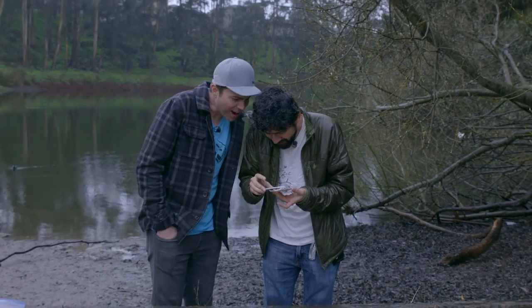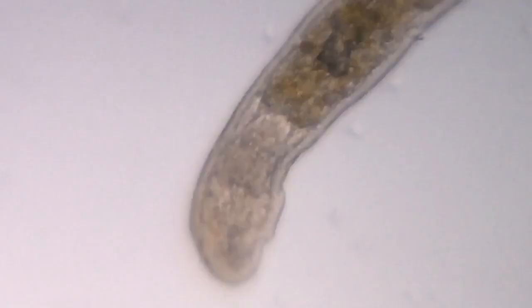When we look at the back, those are the egg sacs. Dude! I was not kidding. Oh my gosh! So this might be... I'm holding in my hand a microscope that is waterproof, stomp-proof.